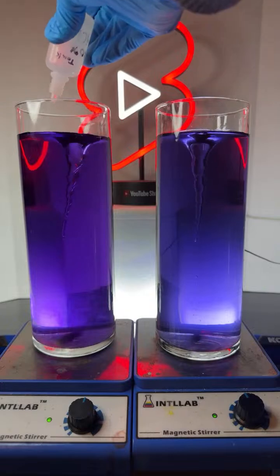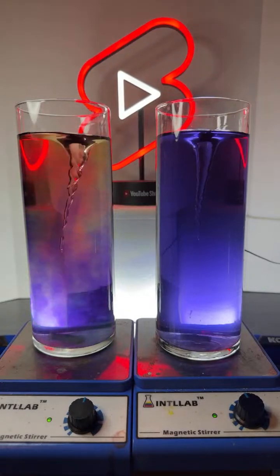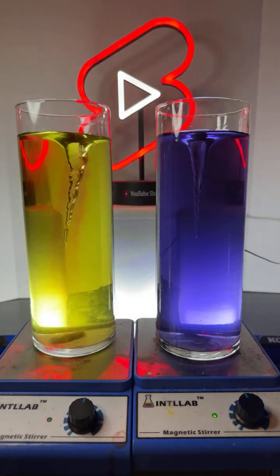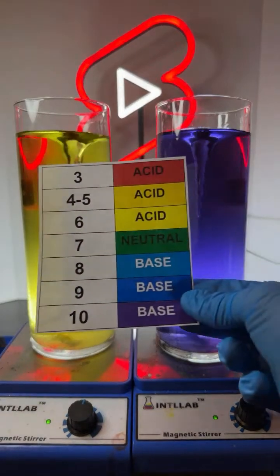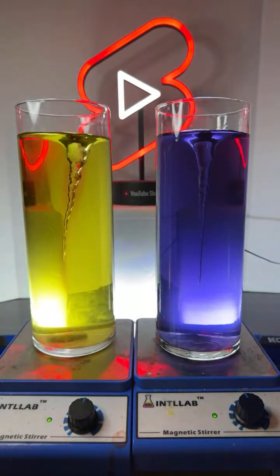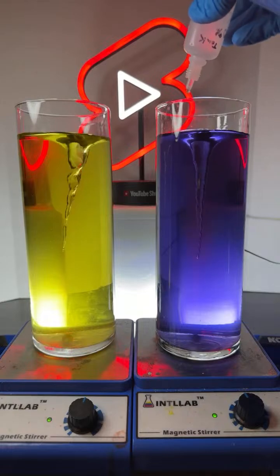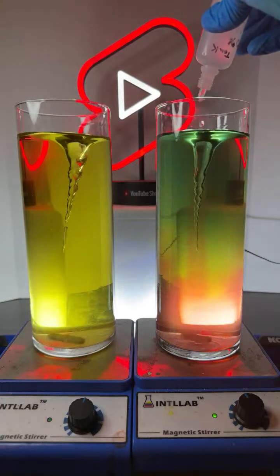Here we go. Over here on the left, add a little bit of acid. 3 drops. Got a little rainbow action there. And it looks like our pH has relaxed to about pH 6. Yeah, what do you think? Sure enough. And we'll try the same over here on the right. We're going to add a little bit of acid. The acid I'm adding is hydrochloric acid. It's the same acid that's found in your stomach. Got a little rainbow action going on there.